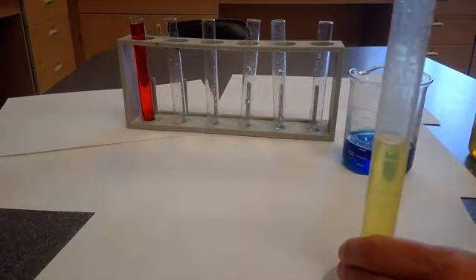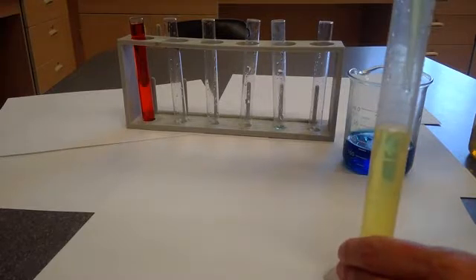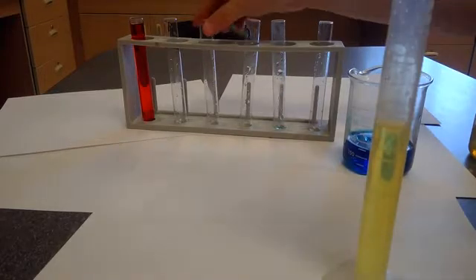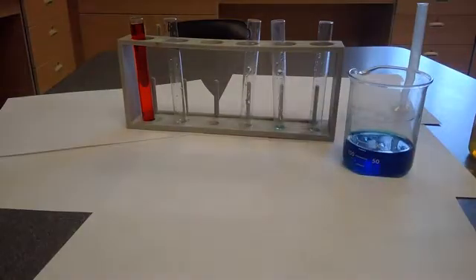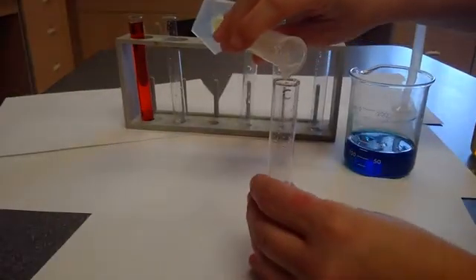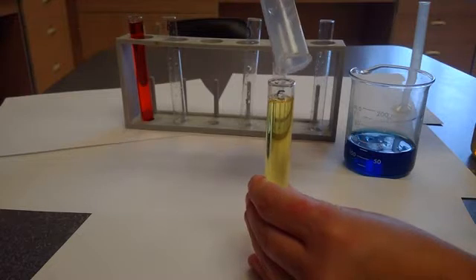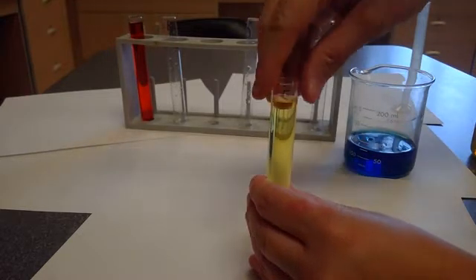So now I'll add the rest of the yellow. And then very carefully taking my eye down to the side and measuring on the lower part of that meniscus level. And then of course I'm going to pour that into C. I have to be extremely careful that I don't spill, or it will completely impact the results.